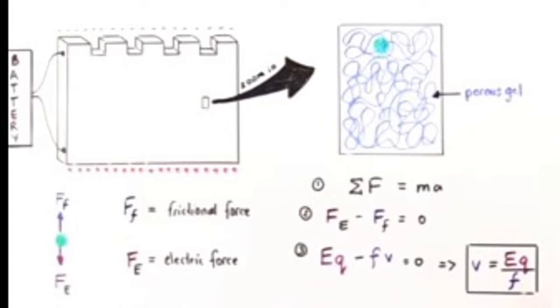Now notice one thing. We have wells on top here. These are wells. Well 1, 2, 3, and 4. There are 4. So this is number 1, number 2, 3, and number 4.